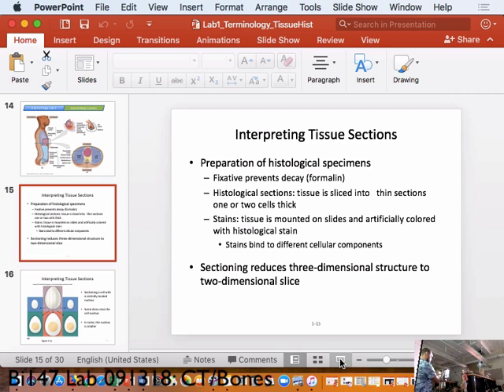Now, I realize that many of you have probably already used a microscope. Who has used a microscope before? Okay, good. So most of you, good. And I'm glad you have that experience. I am going to tell you how to use a microscope so you do it right every time, foolproof, never mess it up, okay?